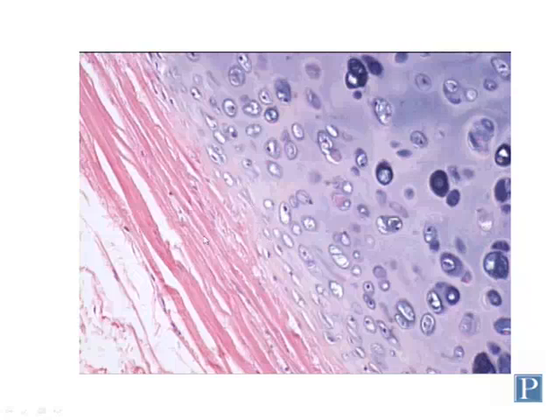Next to the chondrogenic zone, you can see this tissue right here. This structure is called the perichondrium, which means tissue that surrounds the cartilage. Perichondrium is actually composed of dense irregular connective tissue, so it's not cartilage itself. These eosinophilic fibers you're seeing here are the type 1 collagen fibers that are found in dense irregular connective tissue. So you can find fibroblasts in this tissue here.